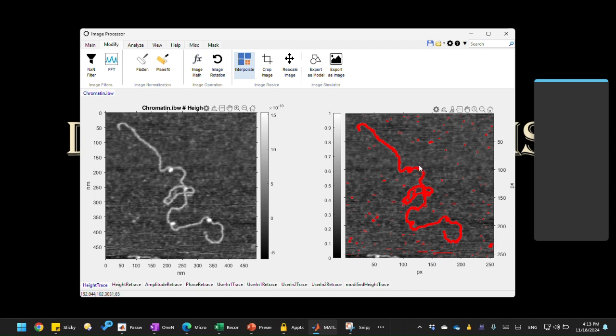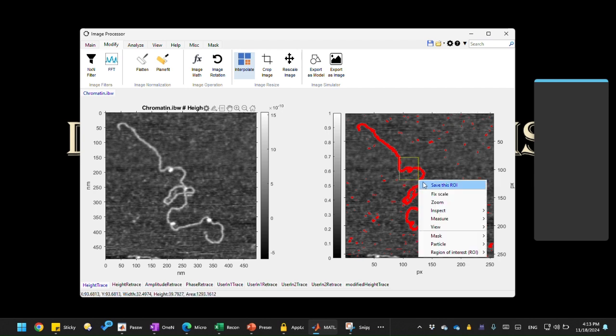Instead, what we did traditionally is to create these manual cutouts, right? We can do this in image matrix. For example, draw this box, and then we can say, let's send that to the region inspector, in which you can analyze this specific region individually.